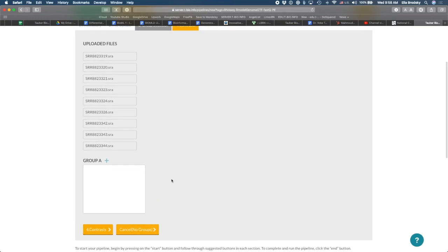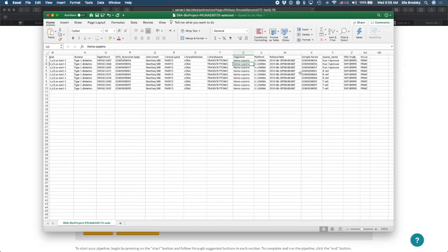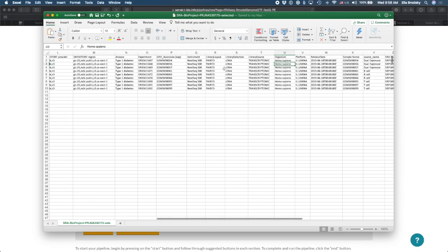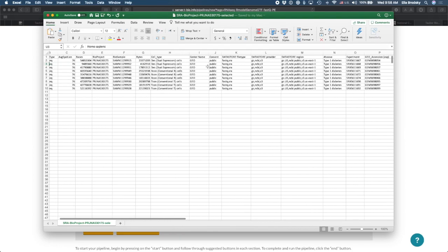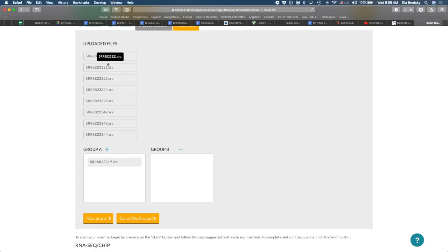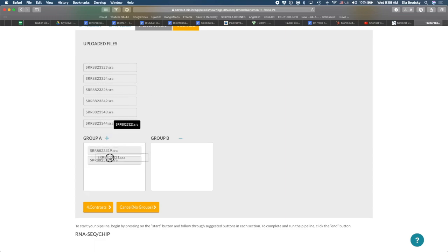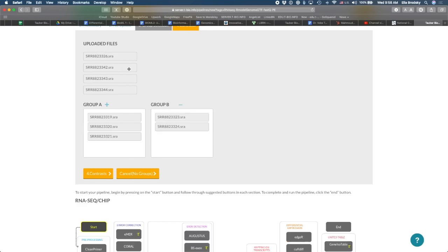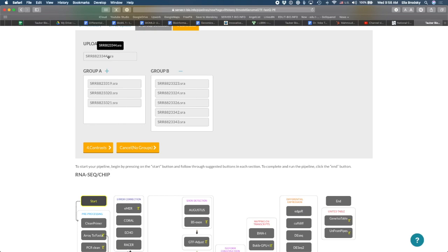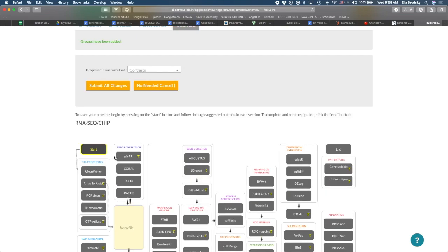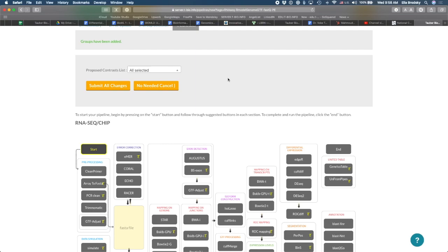And now I would like to compare, for example, my dual expressors versus all the other ones. So the dual expressors are the ones that are, let's look over here, dual expressor cells are the first three ones. And then I have six other ones, B cells and T cells. So I'm just going to put the first three right here in group A. And all the rest I will put in group B. And now do contrasts. I'm just going to have all of the contrasts that are possible. In other words, the first group versus the second group, the second group versus the first group, all of the contrasts.